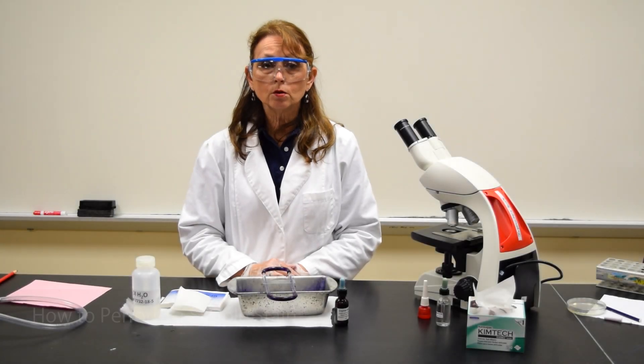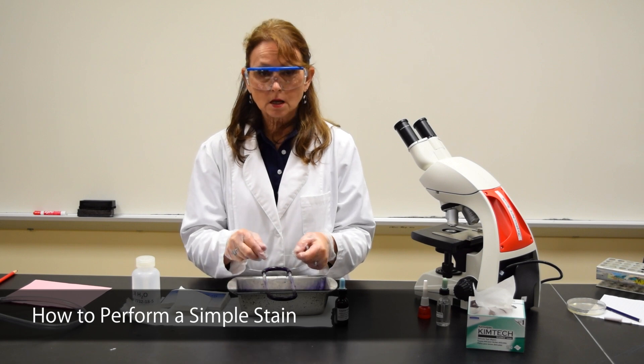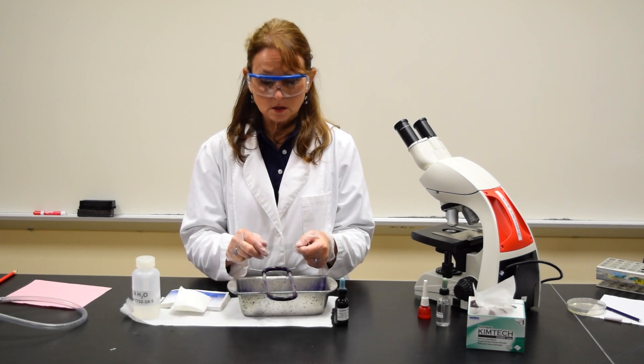This demonstration is to show you how to perform a simple stain. Before staining a slide, you need to heat fix the slide.